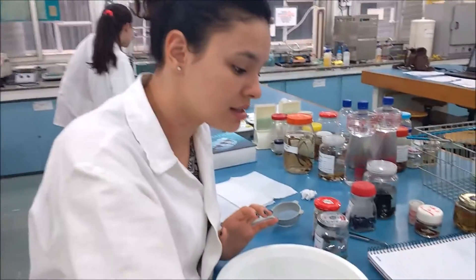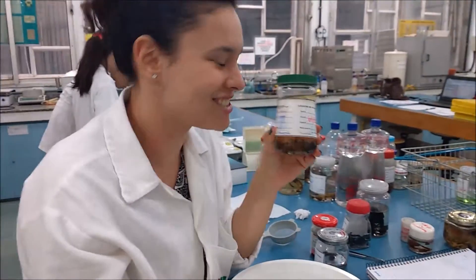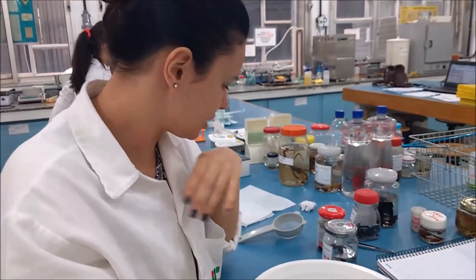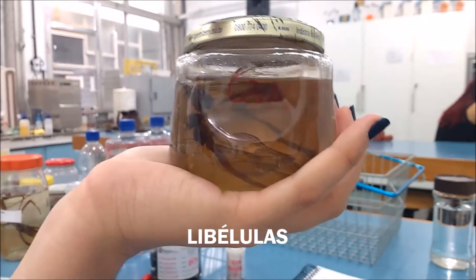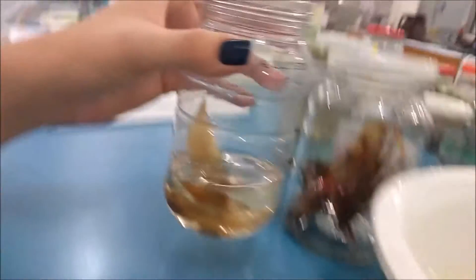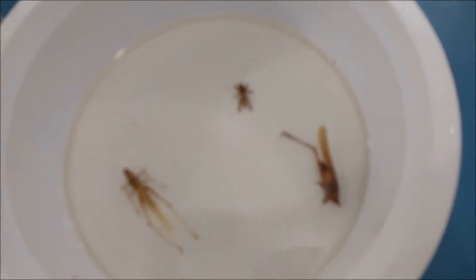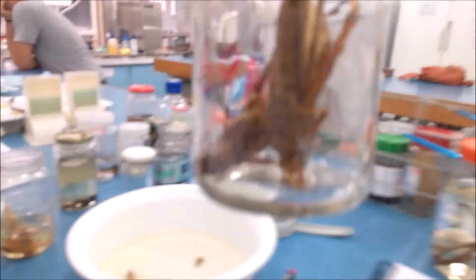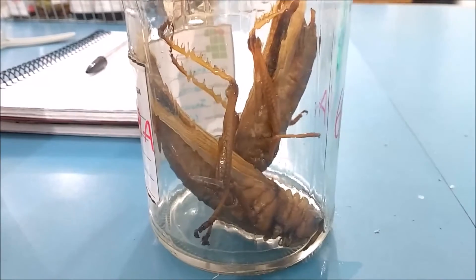These three bottles were separated from the practice group. As a monitor, I have to make my work easier — separate them from the practice collection. This is Group A, the practice group. And imagine that these two here are newcomers, because I'm a monitor at the same time but I don't remember everything — I'm not obligated. I remember I got this one in hand. It's so beautiful.